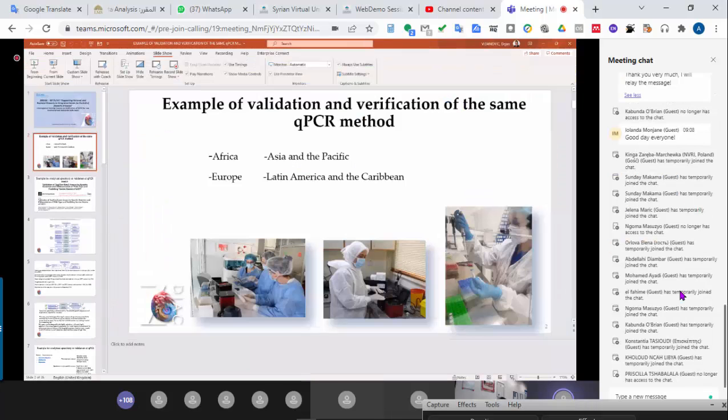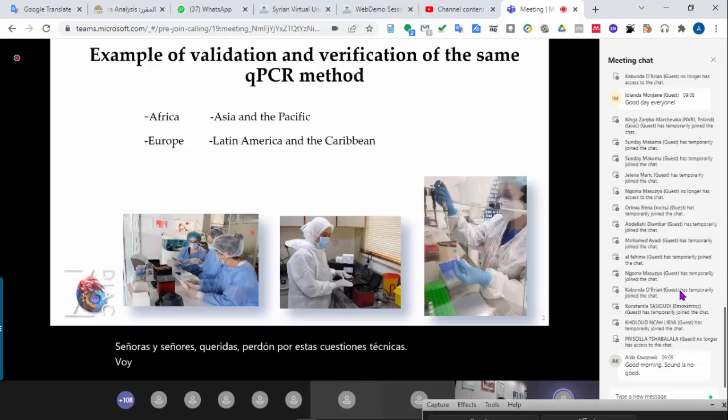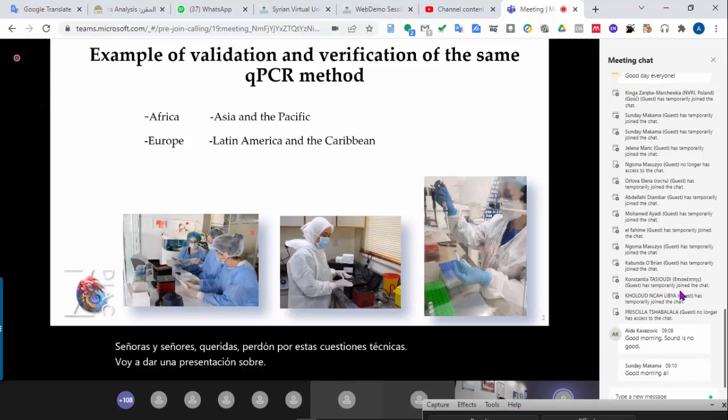Yeah, so, ladies and gentlemen, dear colleagues, sorry for these technical issues. I'm going to give a presentation about a practical case of validation and verification of the same real-time PCR method.